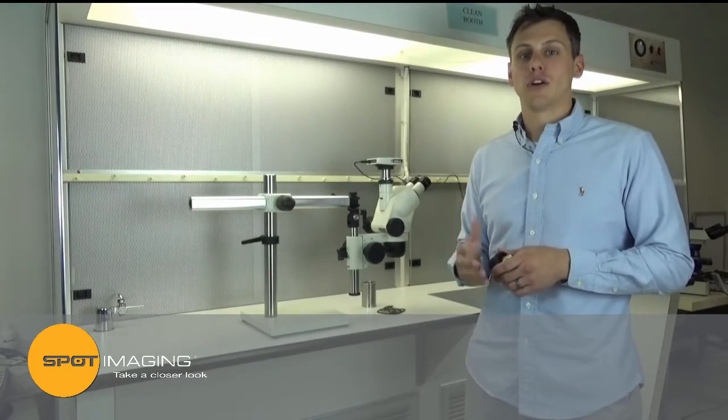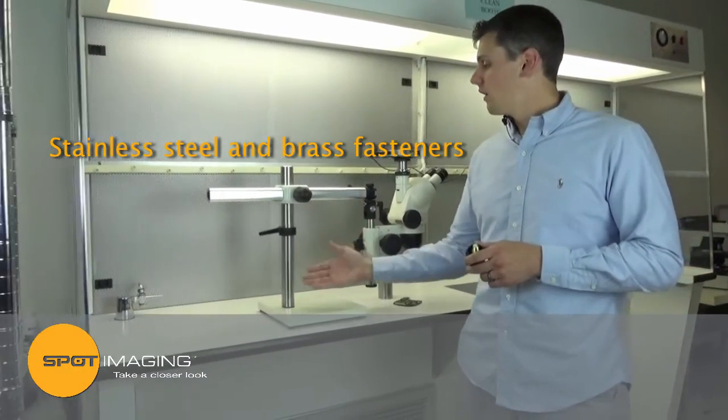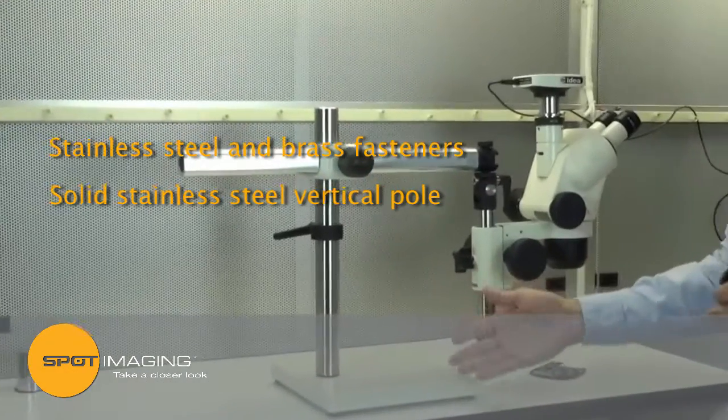We use strong corrosion resistant materials throughout our entire boomstand product line. Stainless steel and brass fasteners, a solid stainless steel vertical pole, and a heavy weighted base.